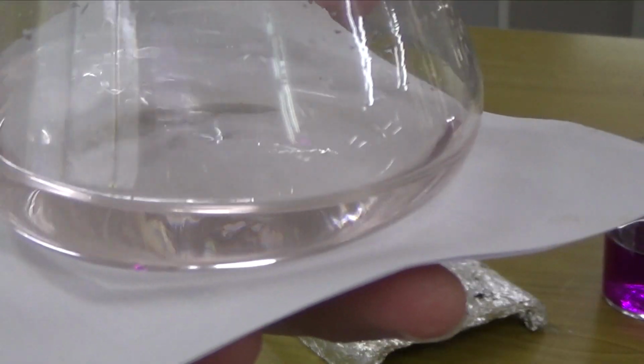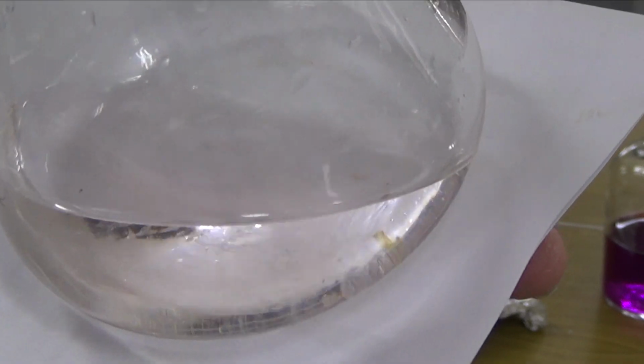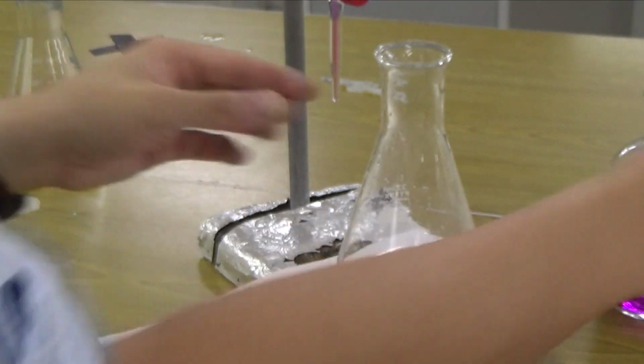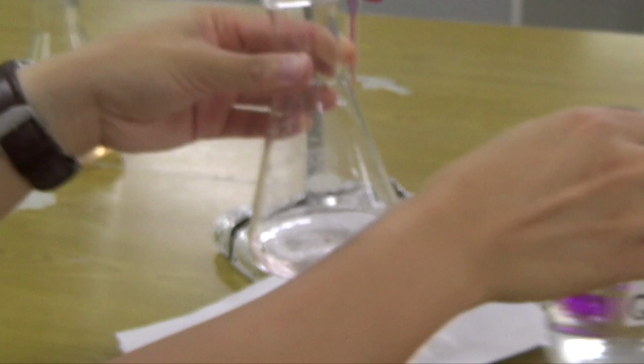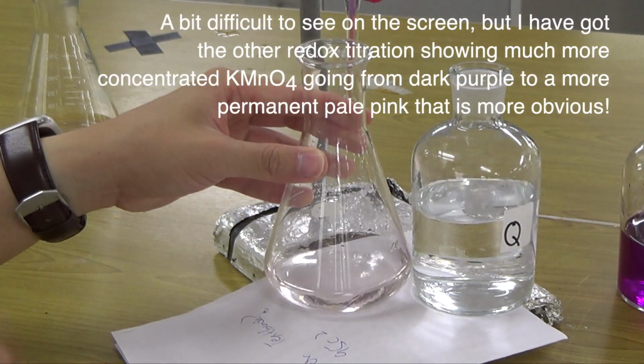So that is kind of like pale pink. Kind of like permanent pale pink, not too sure how well the contrast is. It's very, very light because the solution is very, very dilute. But it is quite colored when you compare with this thing here. So this thing is supposed to be a little bit colored. This thing is totally colorless, okay? So if I put it on a white background, you can hopefully see the difference between the two.